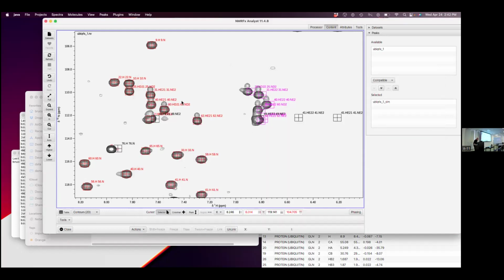One thing you'll see up here, if you click in this slider tool, which was really developed for cyclic peptides, but is most widely used for RNA, widely used in Mike Summers' group and his descendants, etc. If you click on these, you'll see it actually knows that these peaks are related to each other, and has a line between them. For some reason, it froze one of them, it didn't freeze the other. If I go over this one, you'll see that I can move these together because it knows they need to have the same nitrogen shift. So I can move it down there.